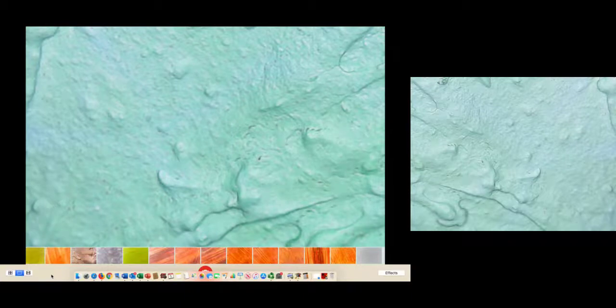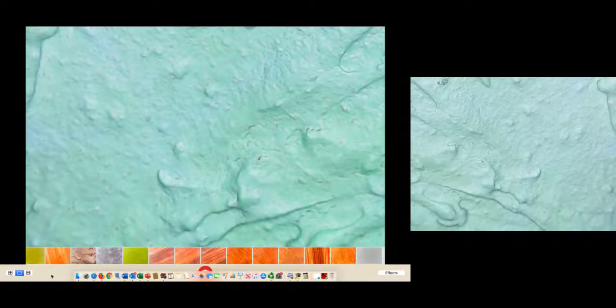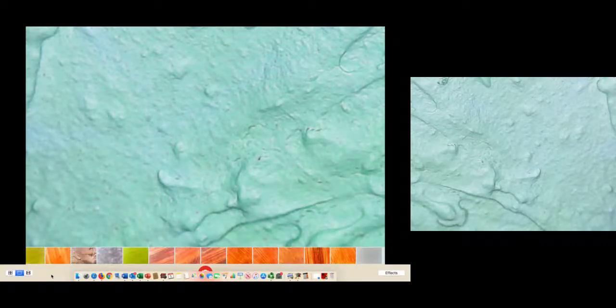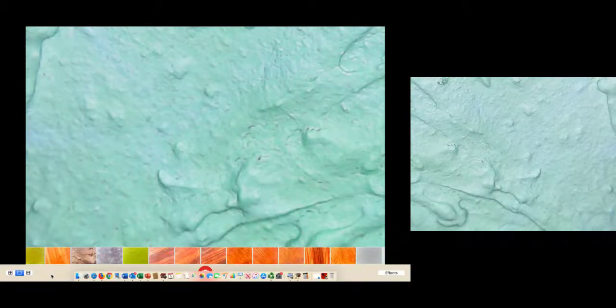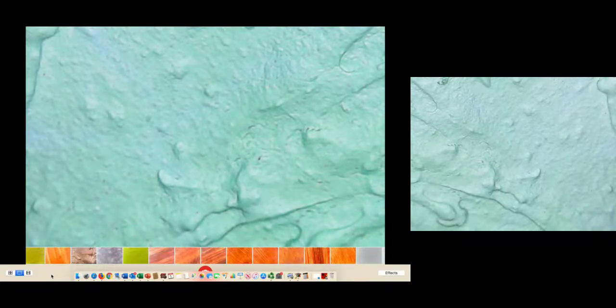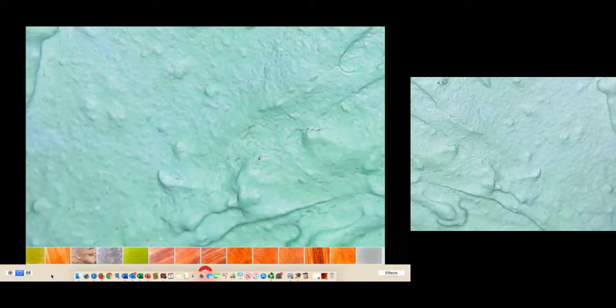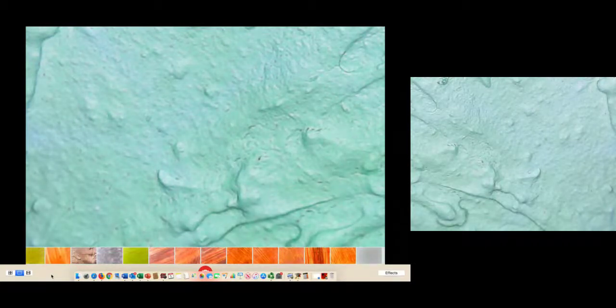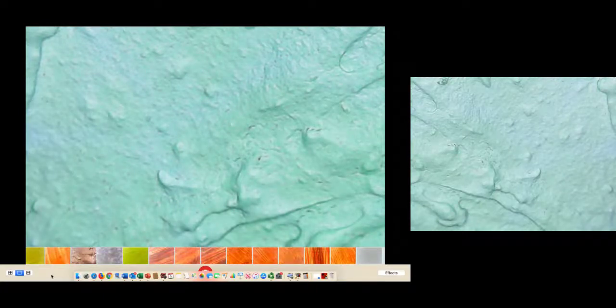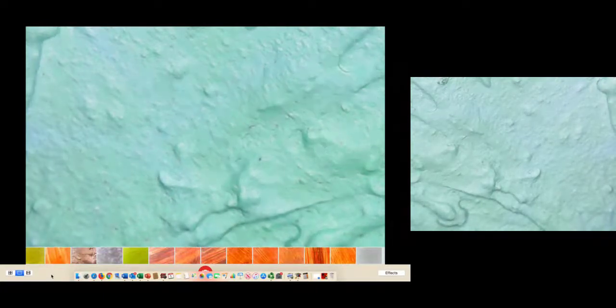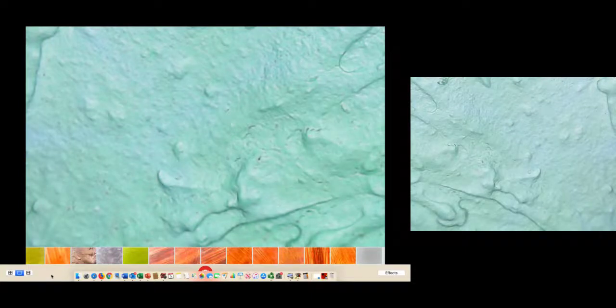What you are seeing here are some test paint formulations I'm preparing, impasto technique. These are commercial acrylic paints, I'm magnifying here with the digital microscope about a hundred times. The foundation is card stock, 140 pound Bristol card stock. I have no undercoat.